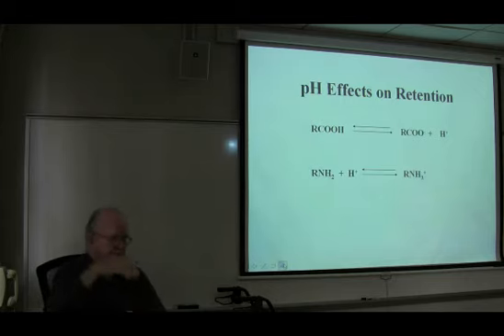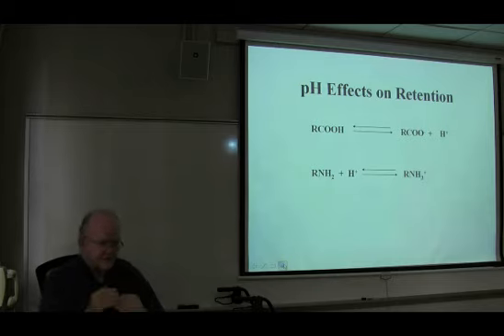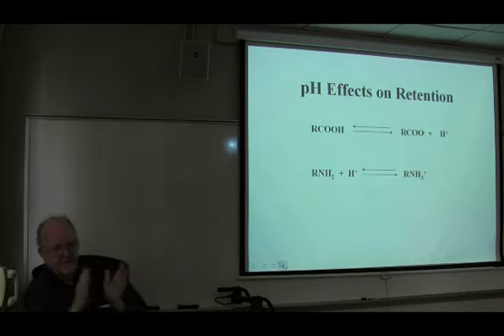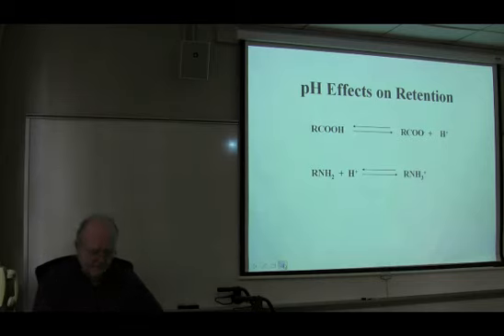It's the Hofmeister salting out coefficient. There will be an effect on a neutral species if you change the salt concentration. But if you keep the salt concentration the same and vary the pH, you're not going to see anything happen to a neutral compound. But you will see all hell break loose for things that can ionize or be protonated.